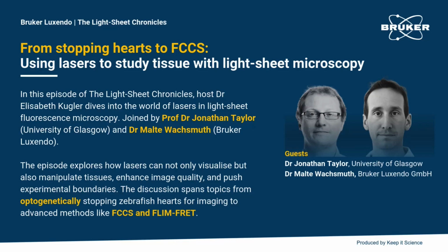And if we can measure that, if we've got precise enough imaging hardware and timing electronics to measure that delay, then we find that different fluorophores have all got slightly different fluorescence lifetimes. So it's already a different mechanism for contrast. But that lifetime is really sensitive to the environment that the fluorescent molecule is in. So it's very sensitive to pH, temperature, and interestingly, proximity to other fluorophores. And so you're starting to get a biochemical insight into the tissue that you're imaging, rather than just structural information. You're starting to learn about the environment that molecule is in. So it requires relatively expensive hardware to be able to do those measurements.